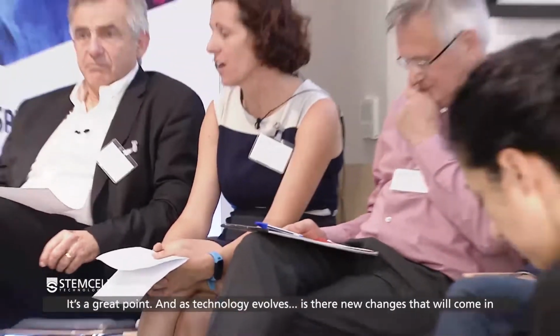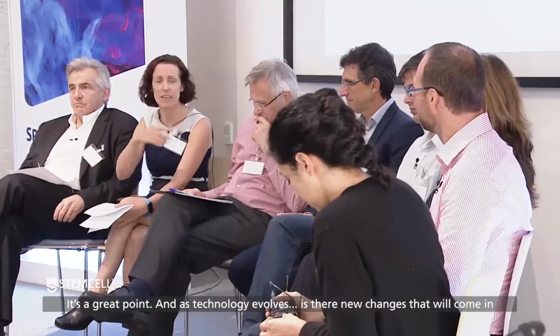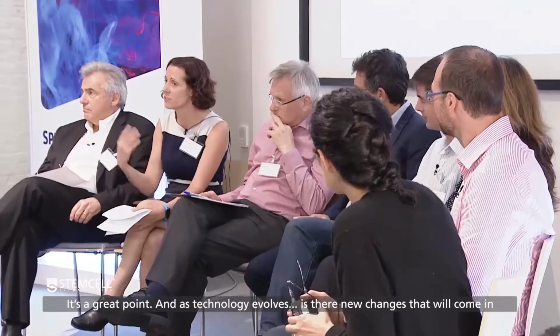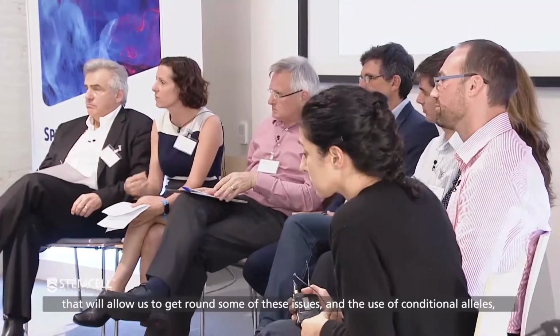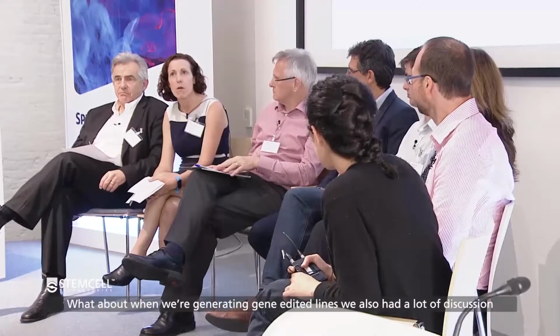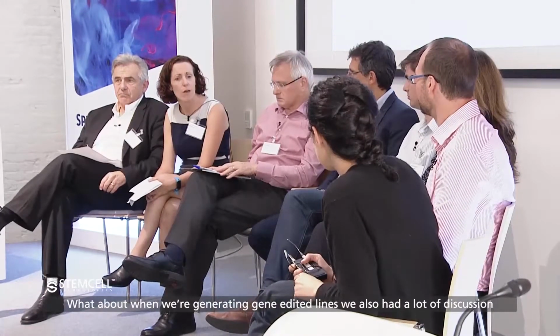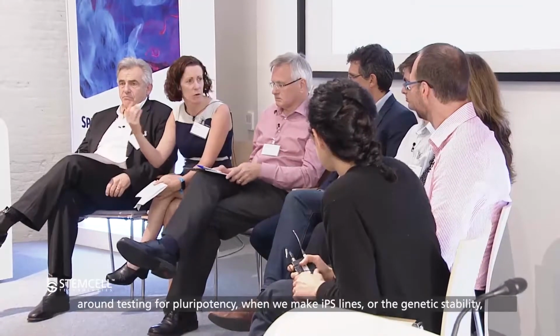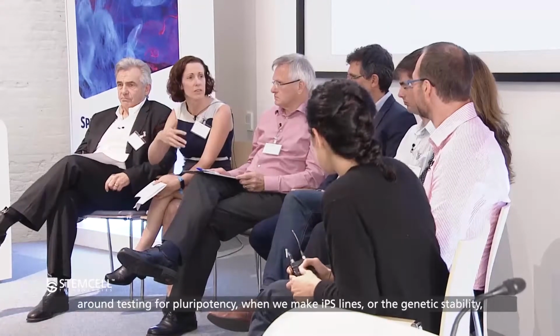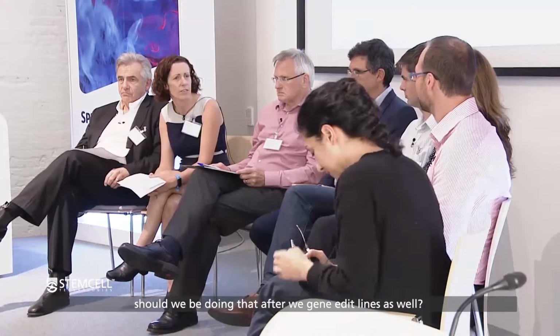Yeah, I think it's a great point, and I think that as technology evolves, and that's probably one of the points we're going to be exploring as we continue the discussion, there are changes and new things coming that will allow us to get around some of these issues, and the use of conditional alleles is definitely one of them. What about when we're generating gene-edited lines? There was lots of discussion earlier about testing for pluripotency when we make iPS lines, or looking at genetic stability. Should we be doing that after we gene edit lines as well? Or is that over the top?